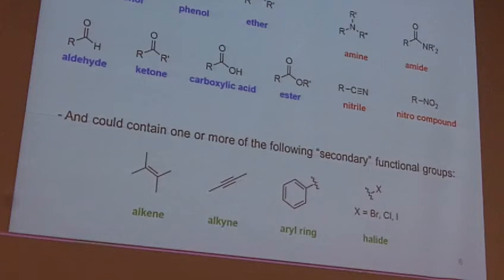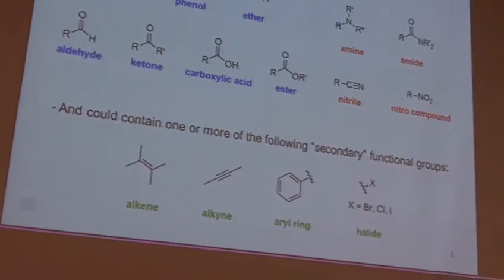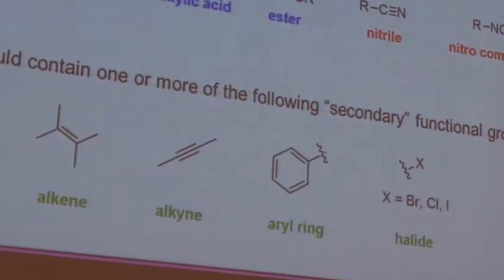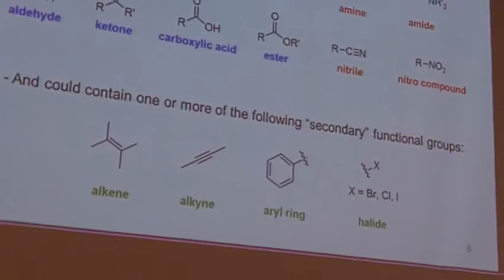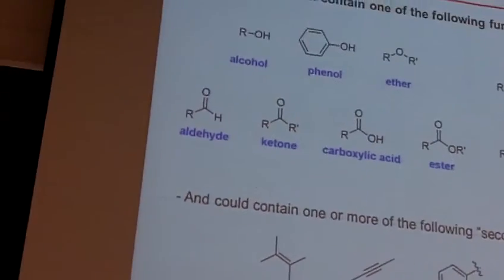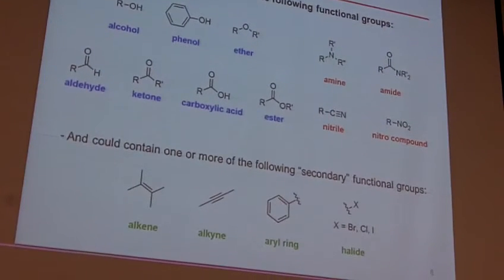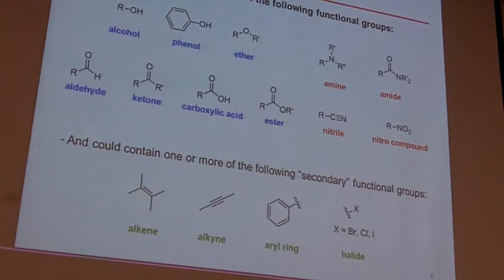So the goal then is to decipher all of this and figure out what exactly you have. Rather than just saying, okay, this is it, go, we're going to walk through and give you a plan on how to figure it out. First things first, you'll notice all of these up here have oxygens. All of these over here have nitrogen, or are nitrogen containing. So you're going to have one of these, and these can be secondary that you may or may not have. Just to clarify that.